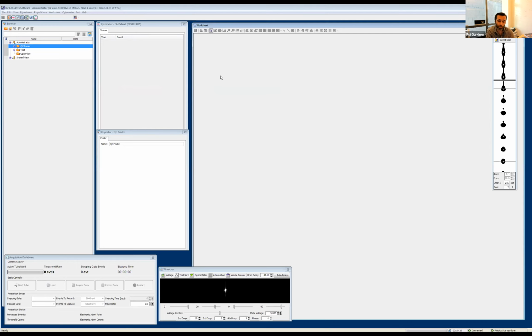There hasn't been a lot of people comparing the sample before it's sorted and the non-sorted sample, but there are some cells where there is definitely a change. The problem is that nobody knows exactly what kind of changes those are, and whether it's really impacting anything. That's the difficult part to address. There are a few people addressing this, but nothing conclusive has come about.